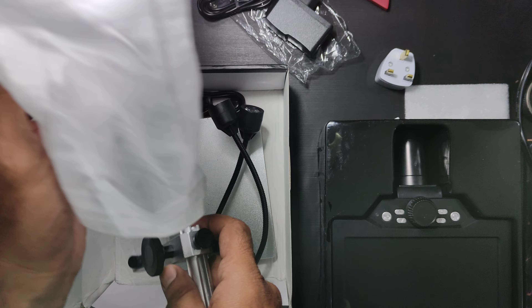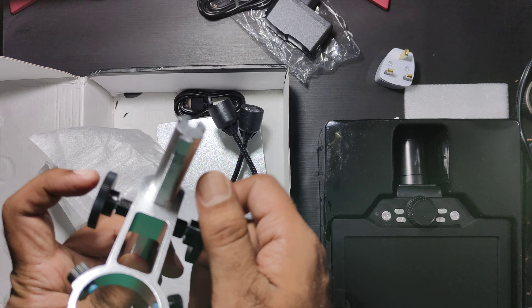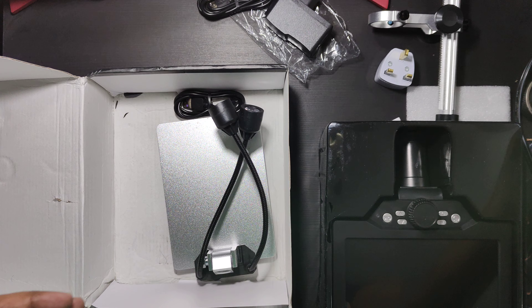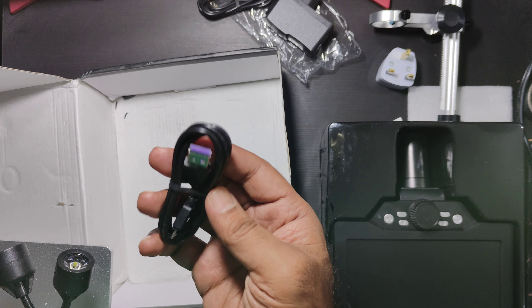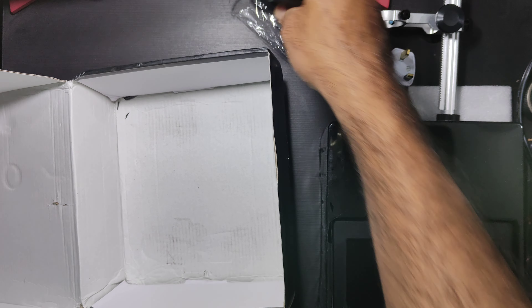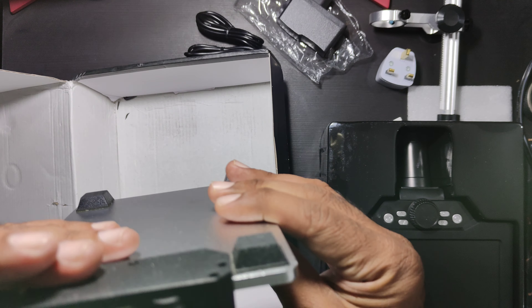So there's one converter plug. This is the user manual for the G1200D. The total cost was about 80 USD.